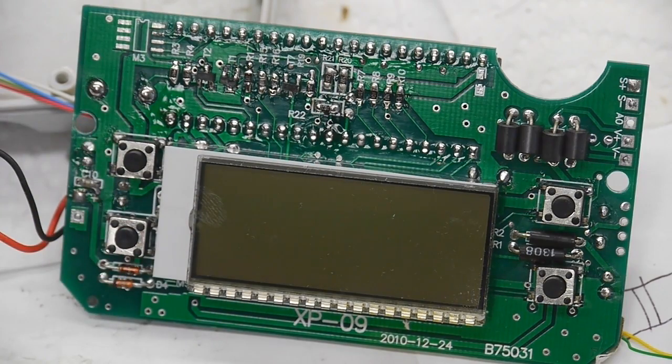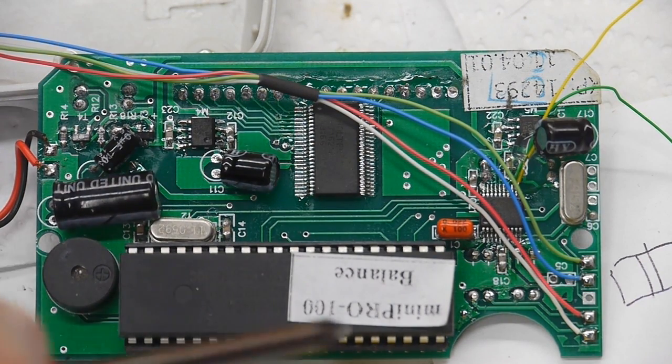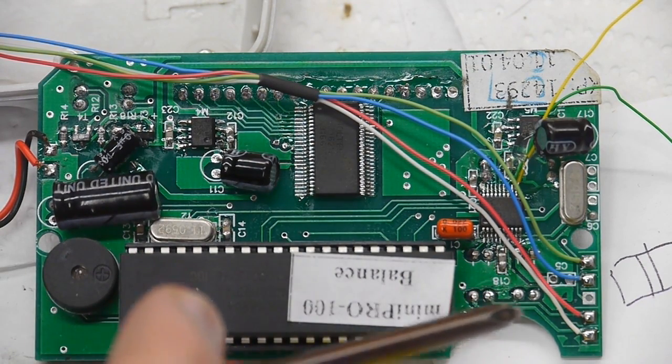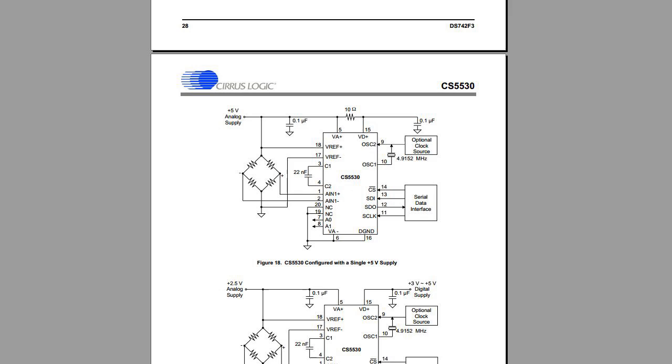This has to be one of the nastiest-looking solder jobs I've ever seen in a piece of commercial equipment. Since the job is to tap the signal and get the actual measured value out of this circuit, we look for ways to tap the lines. Since the analog signal path doesn't really exist - the signal goes straight from the Wheatstone bridge into the ADC through those beads - there's really no chance of adding another ADC.